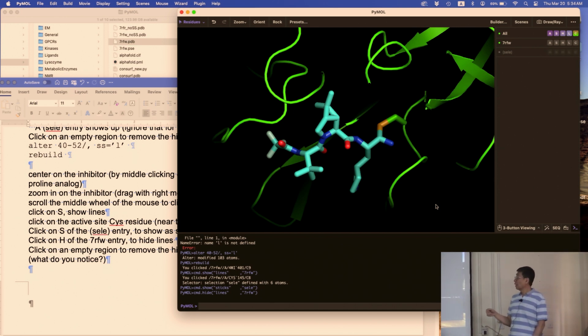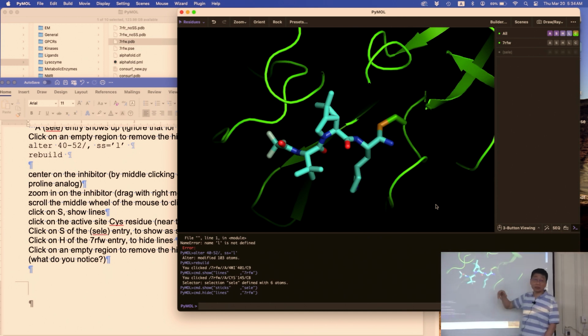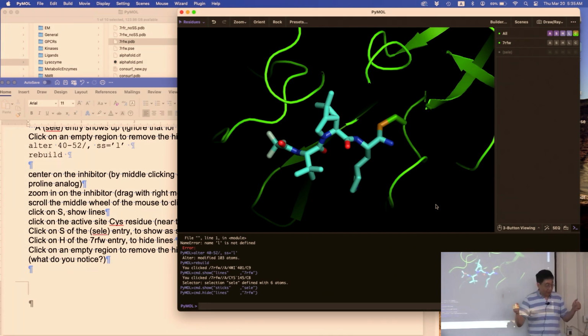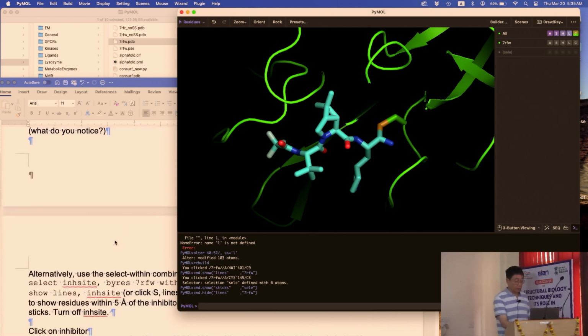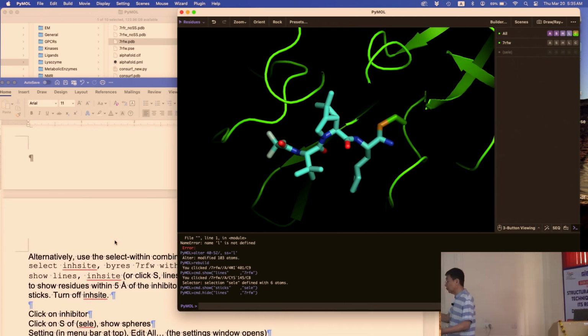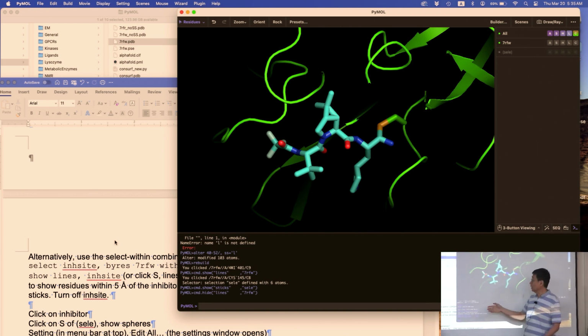So I do this all the time. I turn on the lines. I can see everything I want to see. But when you turn on lines, you're probably swamped by so much information, right? Too much. Okay, good. So there's another way of doing it, which I did not put in the primer last night or this morning. That required a little bit more typing, unfortunately, but it's probably easier for you to see.